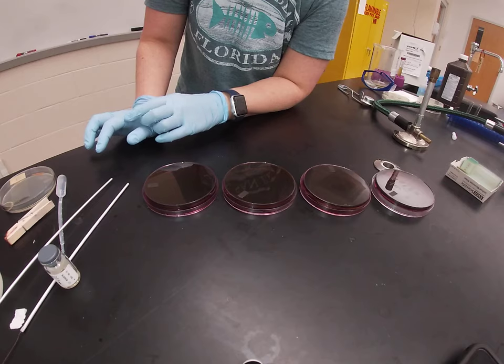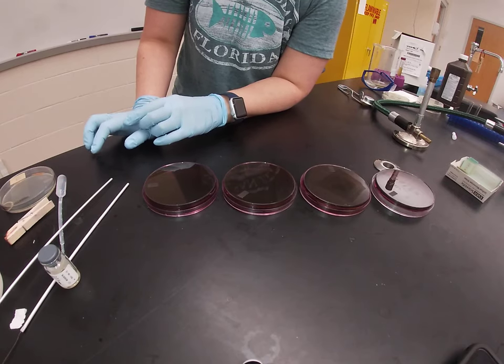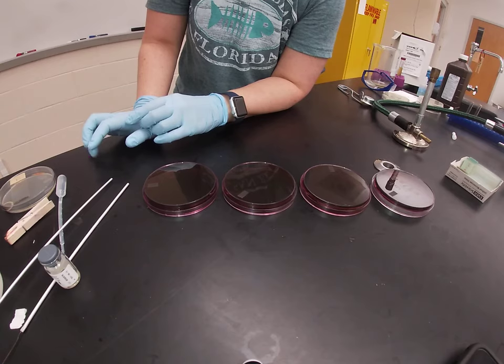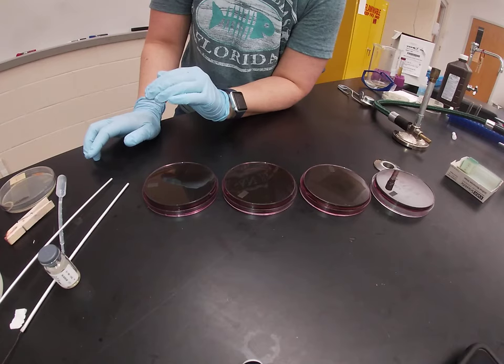EMB is selective by containing two different dyes: eosin-Y and methylene blue. These dyes are inhibitory to gram positive organisms but do not negatively affect gram negative organisms, so our gram negatives are able to grow on this plate.